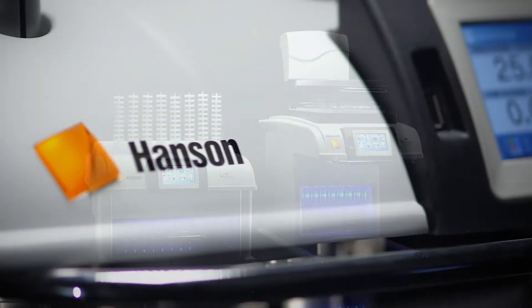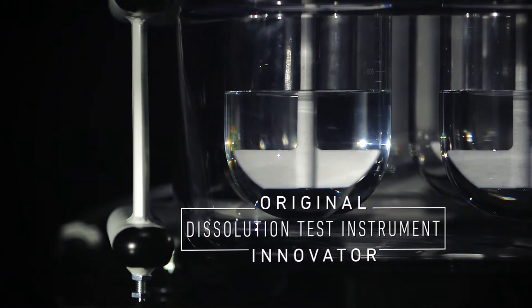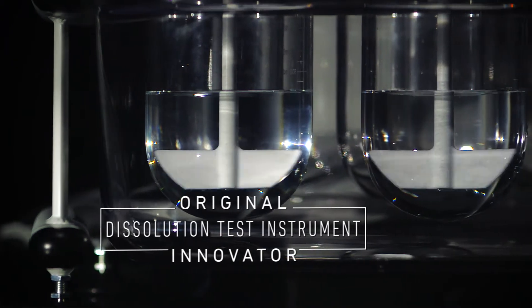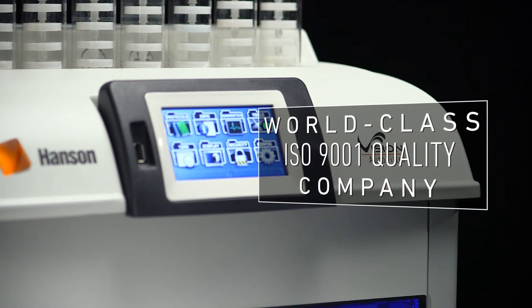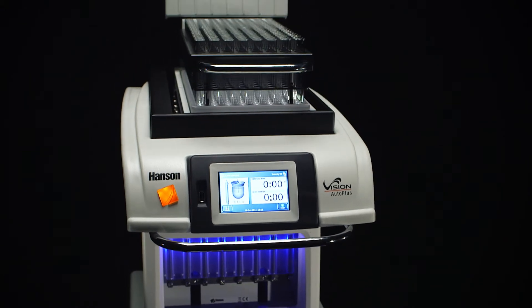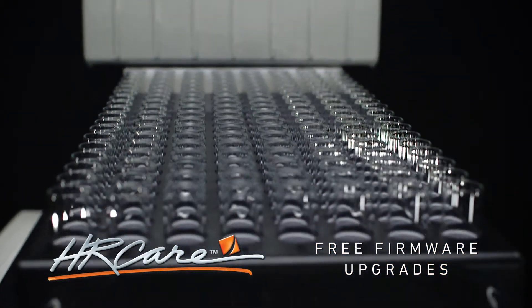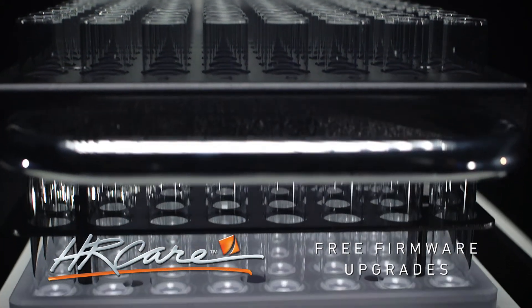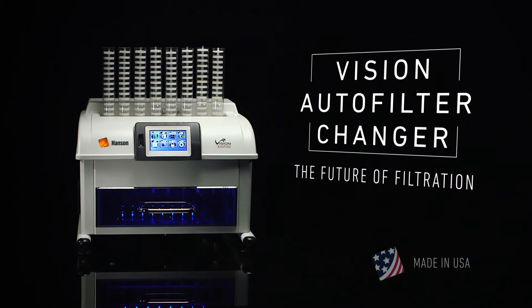Fully utilize the Vision Auto Filter Changer's capabilities by pairing it with the Vision G2 Auto Plus auto sampler. Hanson Research is the first and longest-running engineering firm to specialize in dissolution test technology, providing over half a century of research, service, and expertise. As part of our ongoing commitment to worldwide customer success, Hanson Research offers free lifetime technical support and free firmware upgrades on all Vision products. The Vision Auto Filter Changer — the future of filtration.